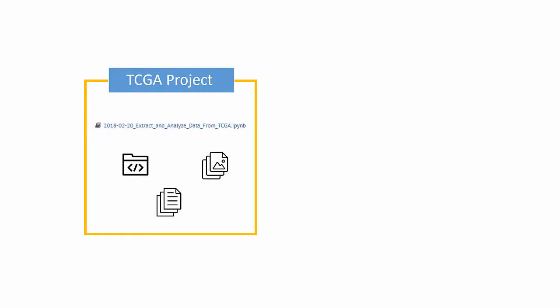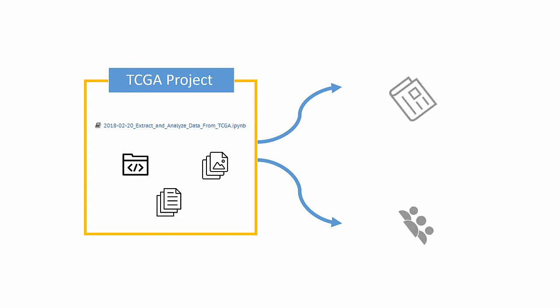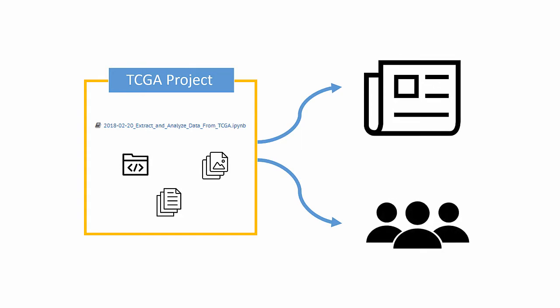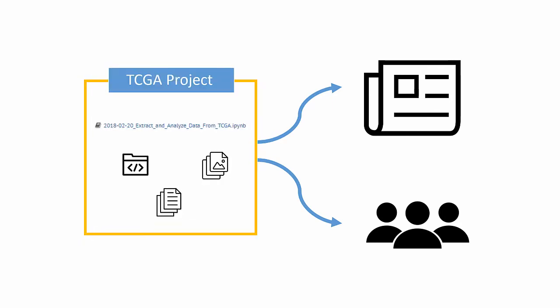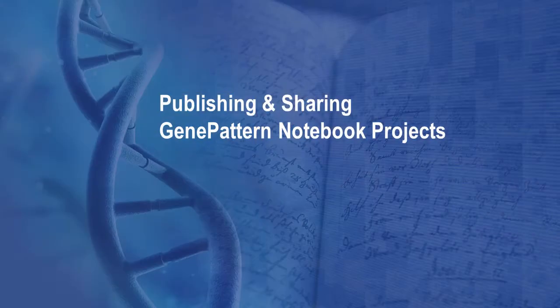The next step in the evolution of GenePattern Notebook is here. You can now share and publish your projects, as well as access those shared and published by others. With this step, projects are now the standard unit of operation in the GenePattern Notebook Workspace. An intro video for notebook projects can be found via the link in the upper right.